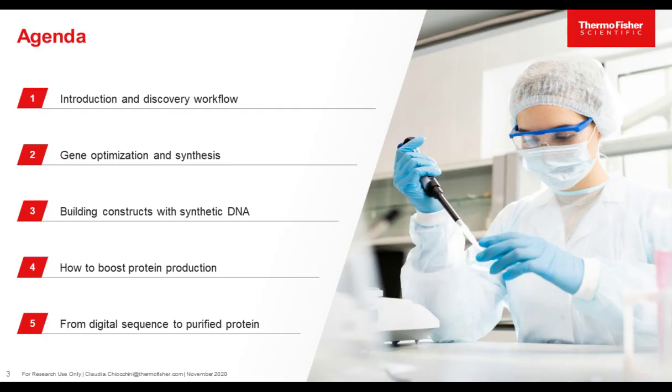Okay, here is the agenda for today's webinar. I will start by introducing gene synthesis, how it works, and how it can facilitate your discovery workflow. I will then explain what gene optimization is and why it is key for successful gene expression and ultimately for increasing protein production. I will describe how to effectively join biosynthetic DNA pieces to build larger constructs, and in particular, we will take a look at experimental data obtained when combining Strings DNA fragments and GeneArt Gibson Assembly technology.